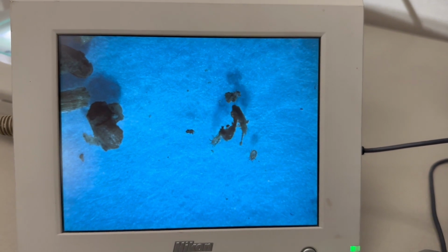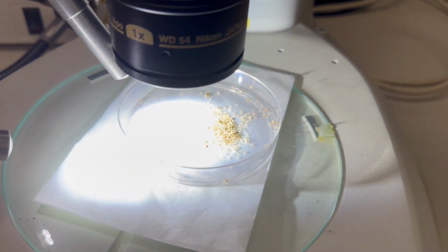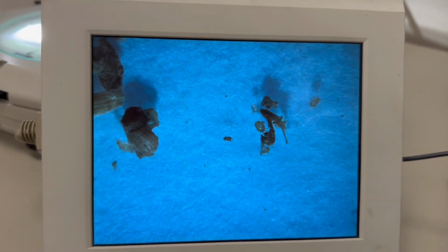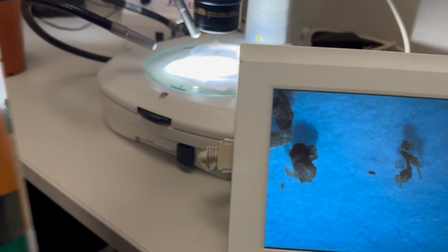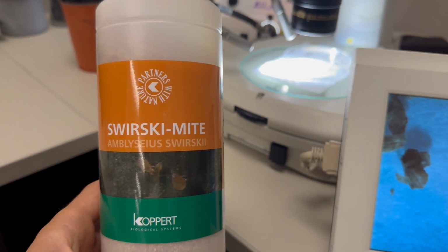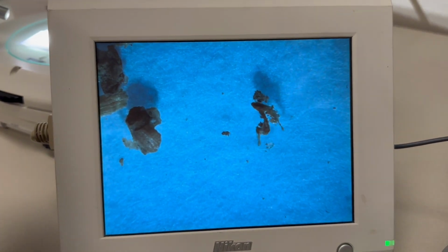Okay, we're here looking at some predatory mites walking around. They're right there in that petri dish, all mixed up with that sawdust-like material, but there's a bunch of them, and this is what they look like. I just poured some of the contents of this bottle. Again, this is Amblyseius swirskii from Koppert, and now we're going to try and put them together with some agave mites and see what happens.